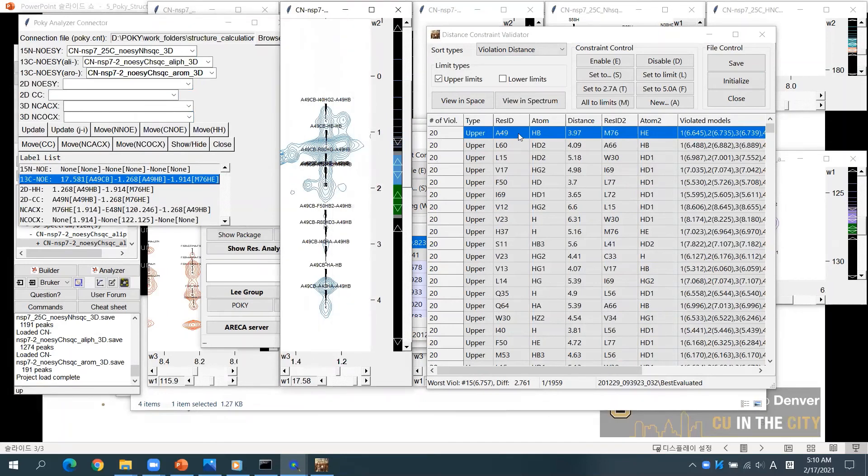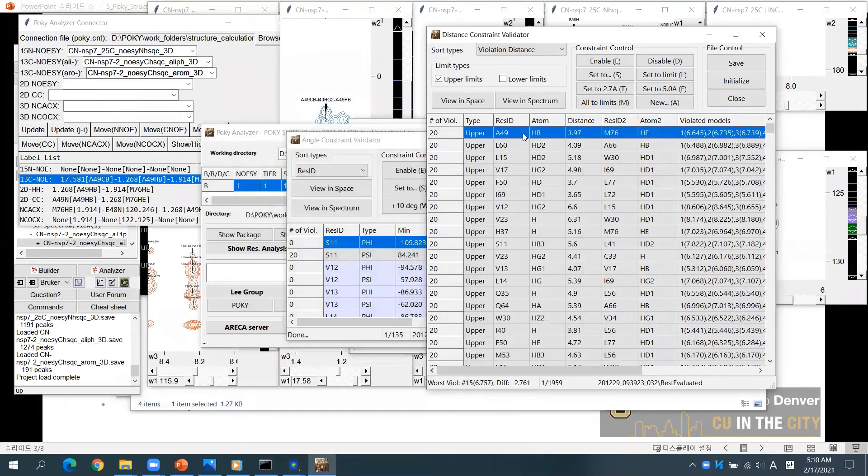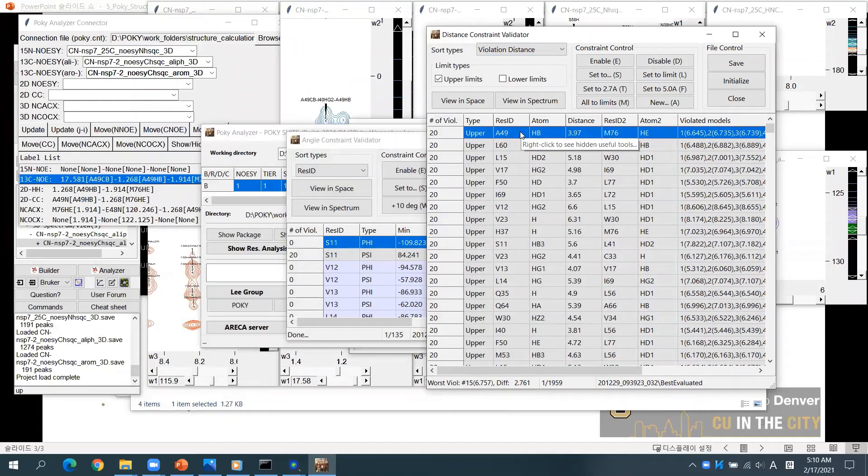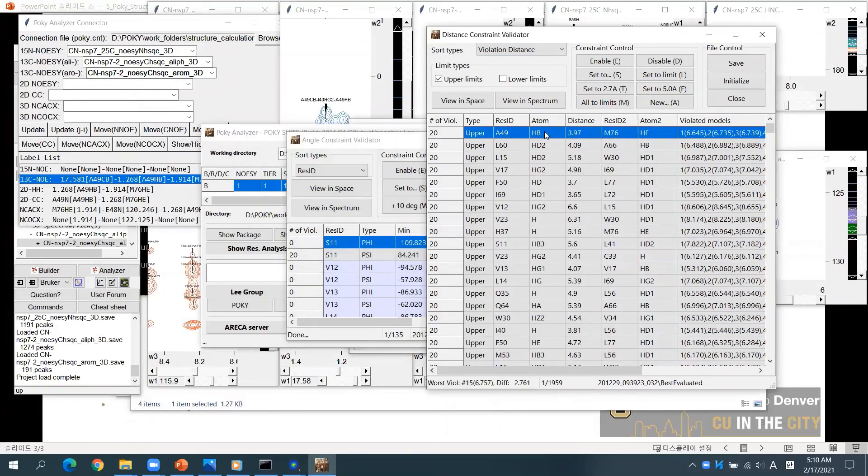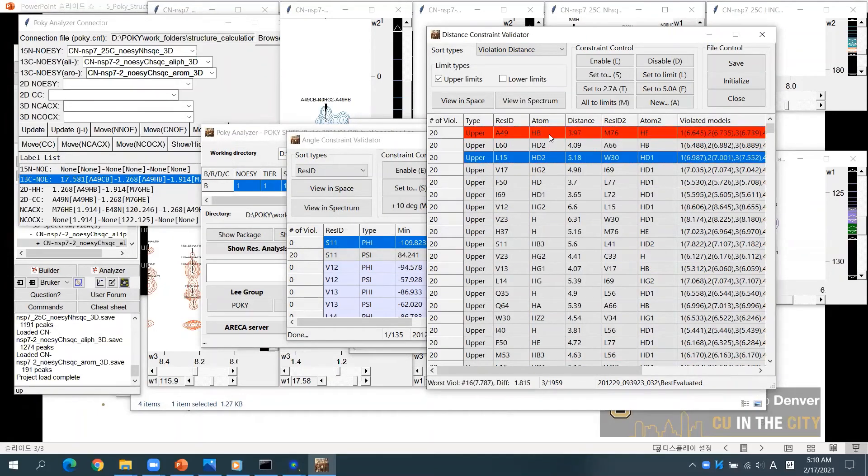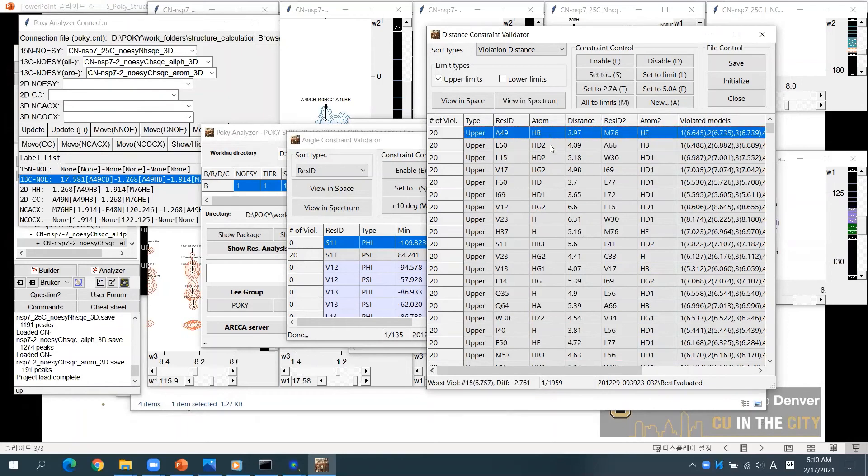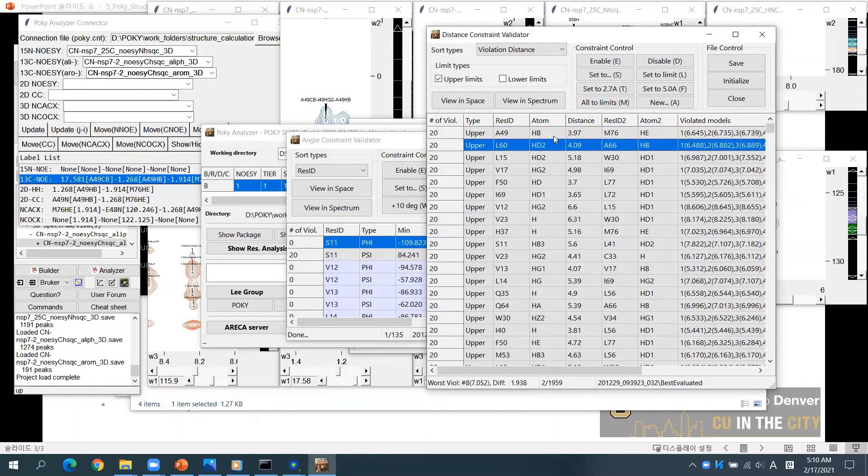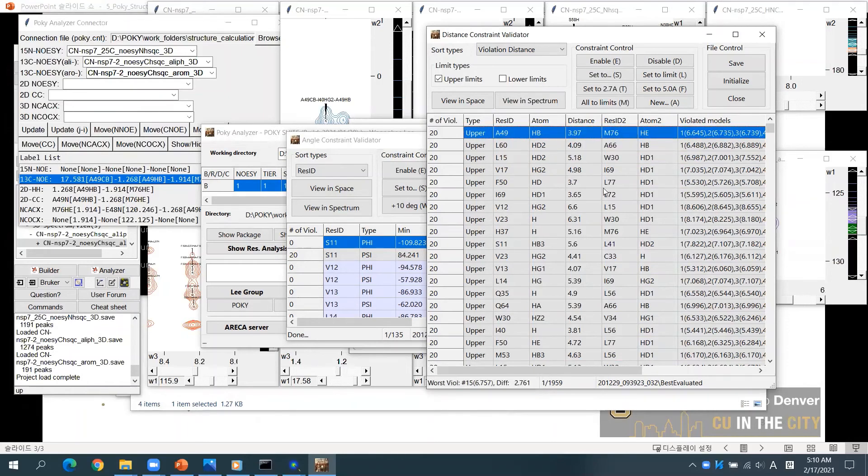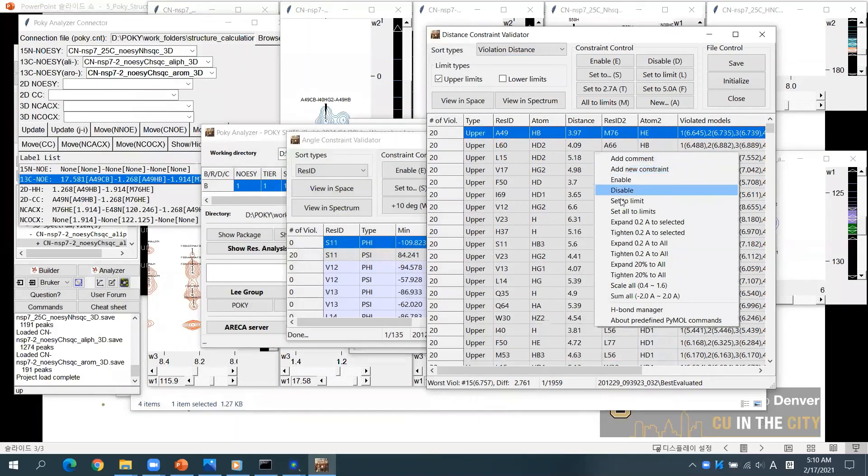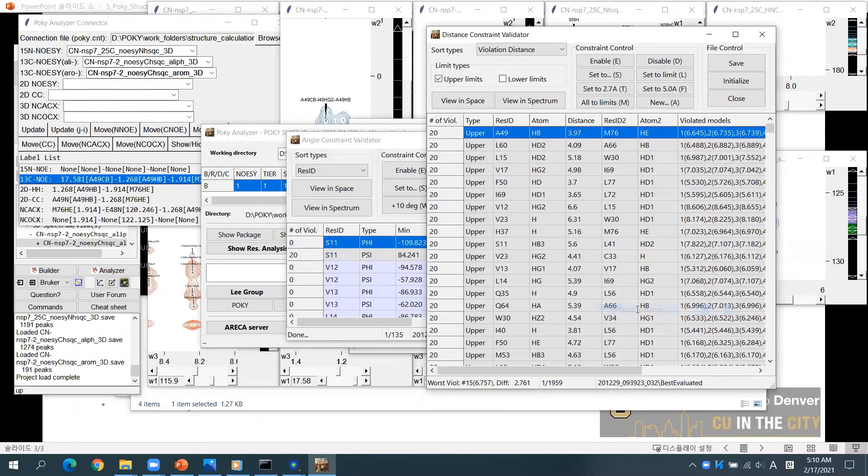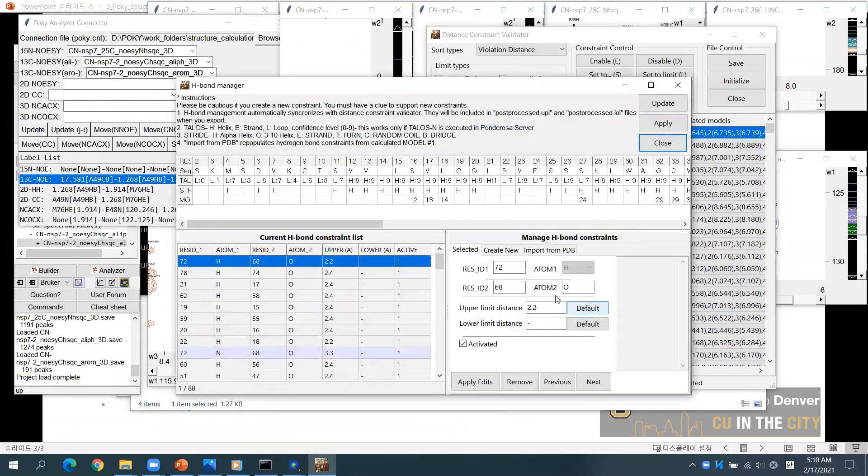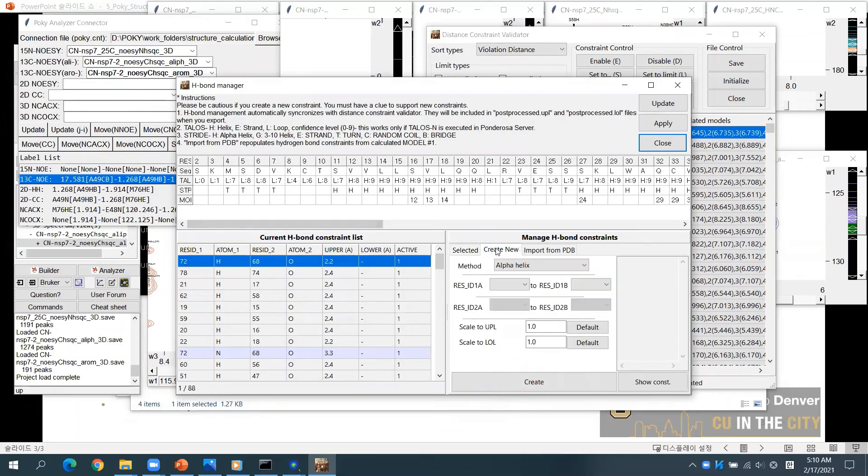You may edit the distance limit by typing S or disable by typing D. To enable it again, type E. If you right-click the validator, you will find various editing options. You can also find HBond Manager from here. Using HBond Manager, you can edit, remove, or create HBond constraints.